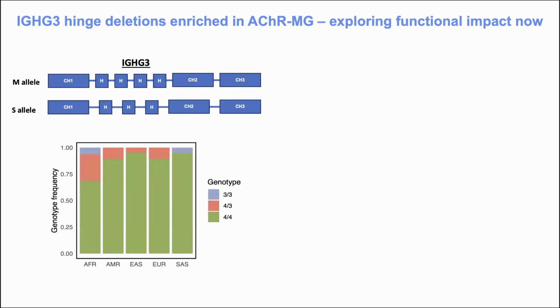This paper actually was just posted in bioRxiv a few weeks ago. We did 105 individuals, just their constant region genes, so 210 haplotypes, and we saw a very different variation. Here, those blue bars that are a small fraction of the populations are people who have 2 short alleles. The pink is when you're heterozygous, 1 long, 1 short, and the green are the long alleles. But you do see, again, across those major global populations that these differ per population, which could possibly explain different susceptibilities in populations to autoimmunity, which is something exciting to follow up on.